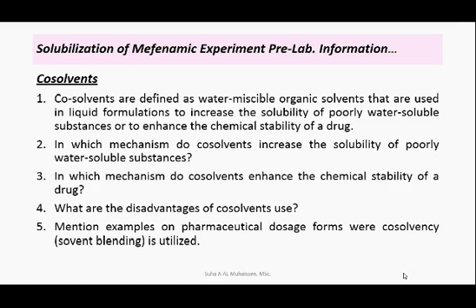In addition, precipitation of a drug upon dilution with aqueous media or during injection or application to mucous membranes must always be considered in deciding if a co-solvent can be used as a vehicle for poorly water-soluble drugs or not. Other considerations include the viscosity, tonicity, and taste, as well as the effect of co-solvents on the solubility and stability of formulation components other than a drug.